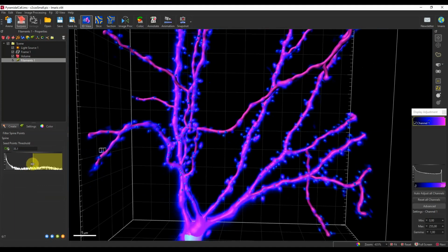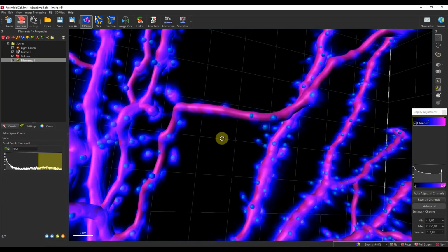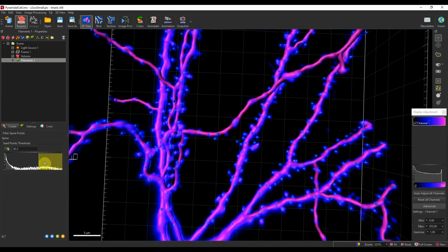Let me just make sure that we get those more or less correct. Again, I will try to zoom in, make sure that I'm getting the spine heads. Yes, more or less, I would say this would be good. I would click on the next button.